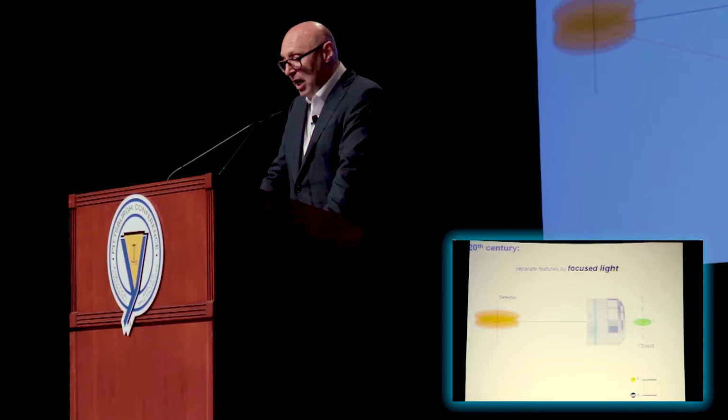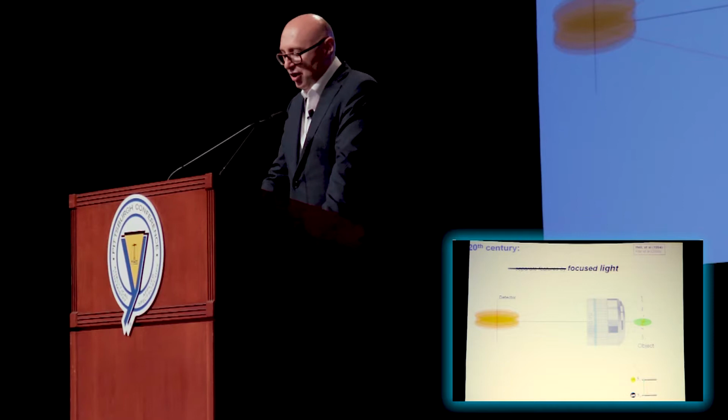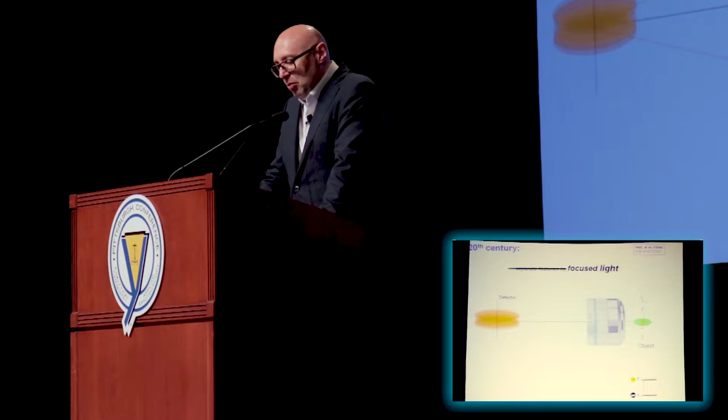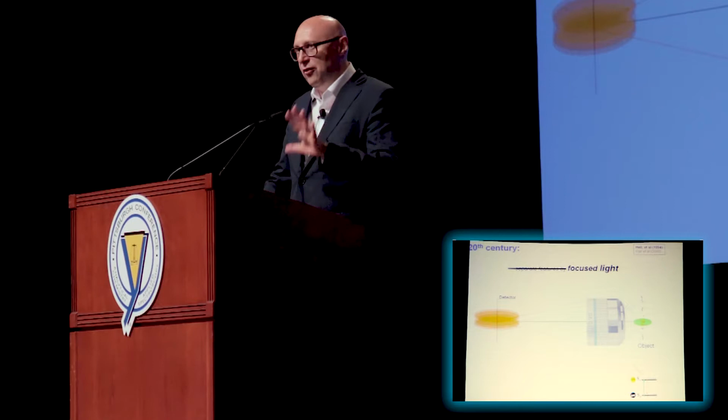So the problem was, and I think this is a very, very important insight, the problem was that people thought that you have to separate by focusing. But if you give up this notion, if you say, okay, we don't want to separate by focusing, we separate in a different way, we can overcome the diffraction barrier. So the actual discovery that has really led to the modern super-resolution techniques and to very high spatial resolution was the idea to give up the phenomenon of focusing for the purpose of separation.